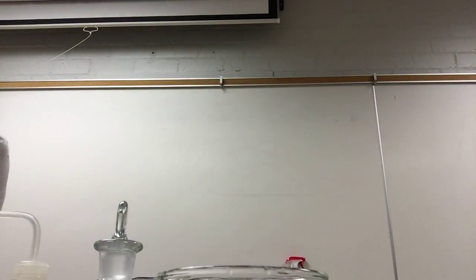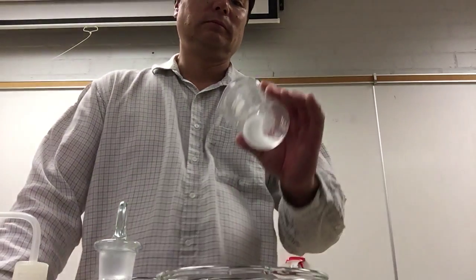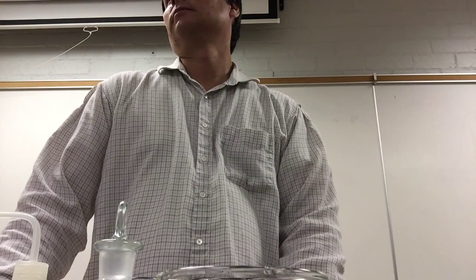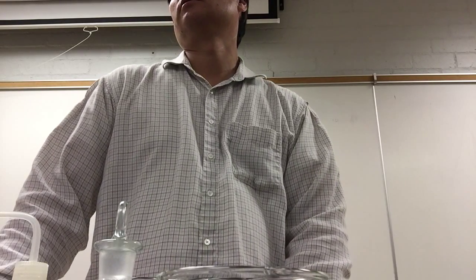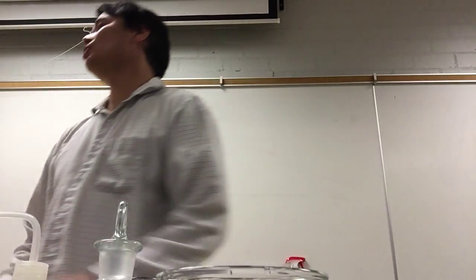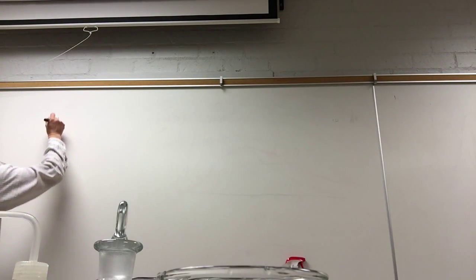What are the first two reagents we're mixing together? The first two compounds. Lead acetate? Lead 2 acetate or lead 4 acetate? Lead 2 acetate.